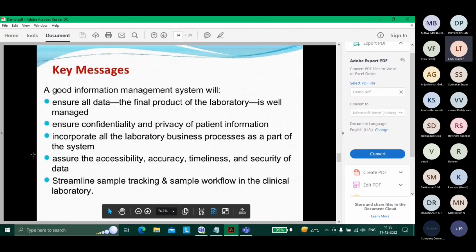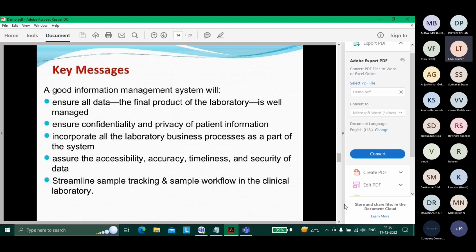And all the big vendors have kept this in mind, and they have prepared these tools in a quite good and efficient manner. So that's where LIMS comes into the picture, and that's why this beats the paper-based system we used earlier. The digitization is coming, and we can hear that all the pharma companies, the petrochemical companies, the tobacco manufacturing companies, whoever it is, are moving to LIMS. Everywhere you will be hearing LIMS in the pharma industry or otherwise: LabWare, LabVantage, Sample Manager. These are mostly heard of.